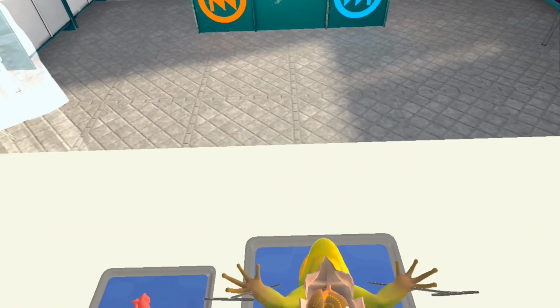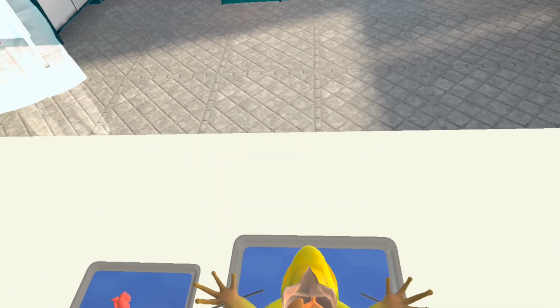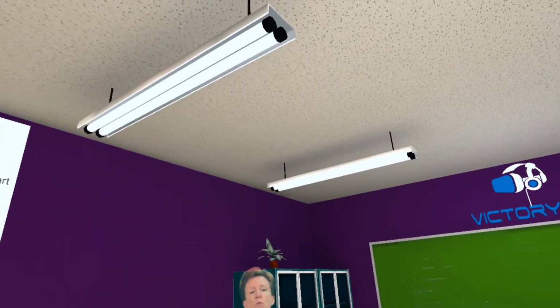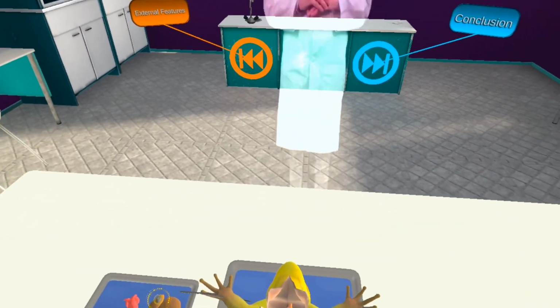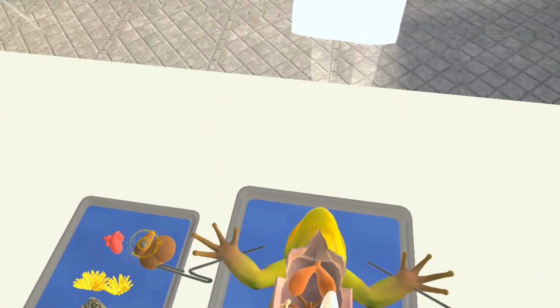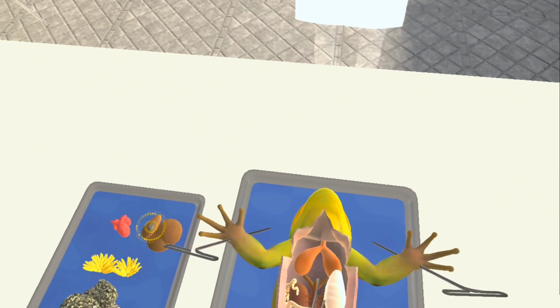Next. Just below the heart, the 3-lobed liver is the largest organ in the frog's body. That is big. It produces bile used in digestion. Go ahead and remove the liver with the forceps. Next. Now pick up the liver and look on the underside of it. You should see a small greenish empty looking sac, kind of like a deflated balloon.